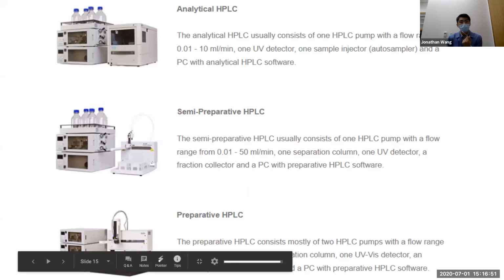Yeah, so some of the different commercially available machines are for different scale operations. What you'll hear most commonly is analytical HPLC, which is when you're injecting samples that are very small, maybe just for analysis. If you're taking some blood samples and you want to see concentration of a drug inside the blood, you're not going to be taking liters of blood from a human. You can only get very small samples. So you use an analytical type HPLC to look at that scale.